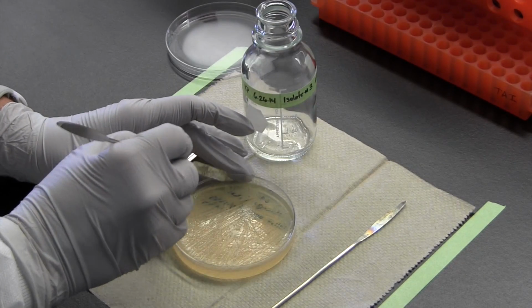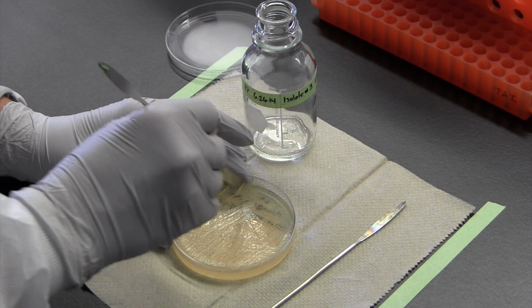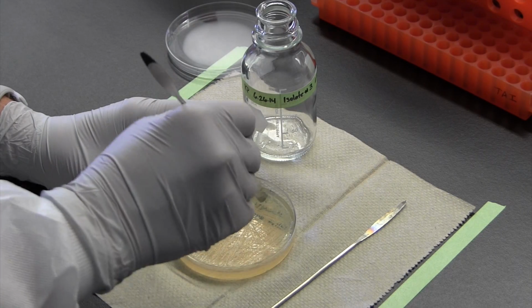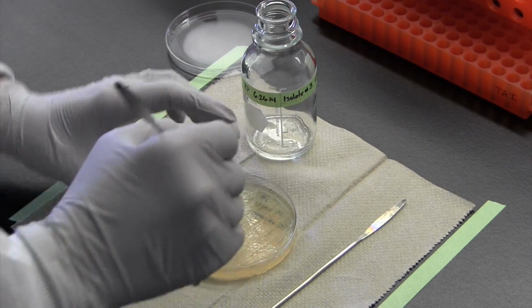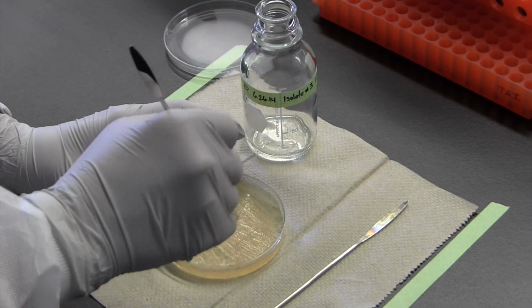So you're going to just basically cut your agar into small cubes. The larger the amount of surface area that you're providing to your chemical extract, the more likely you're going to get a higher concentration of chemicals out. So I'm just breaking through the agar. I did just like a grid, and then I'll turn it this way.